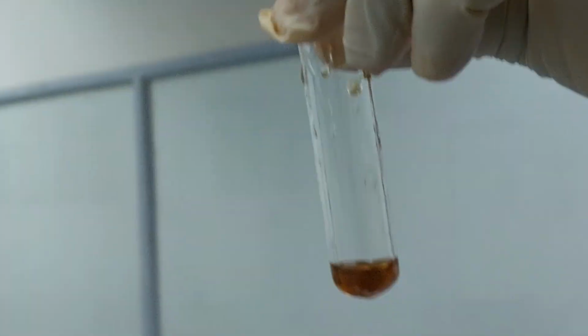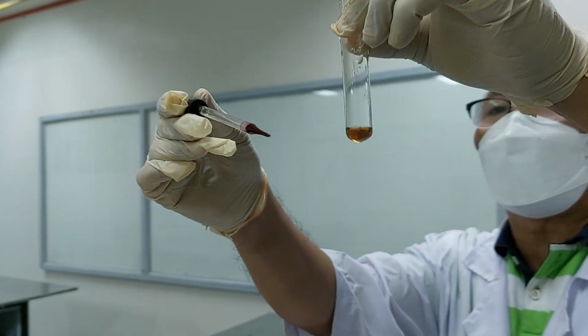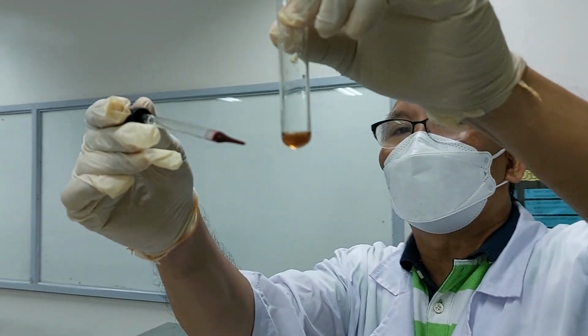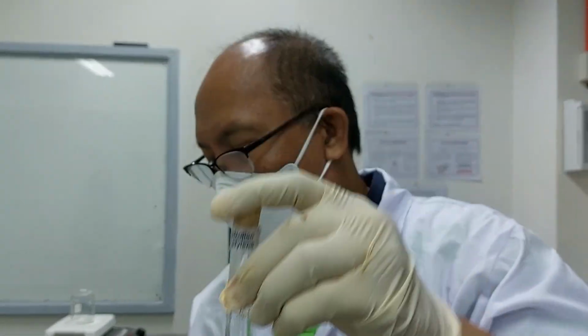Potassium permanganate is violet, as you know. Okay, as you can see here, this is your potassium permanganate. No? You can see the difference in the color. Okay, so this is positive, no? For the presence of acetylene. No? Let's try one more.